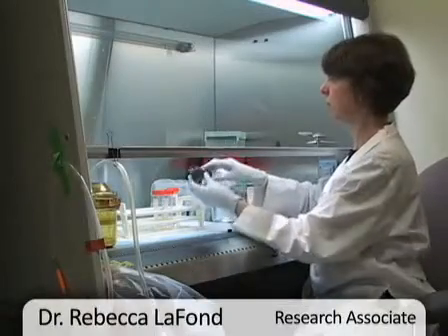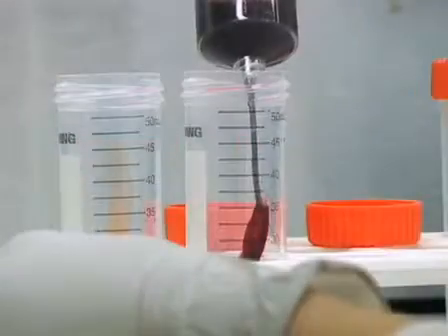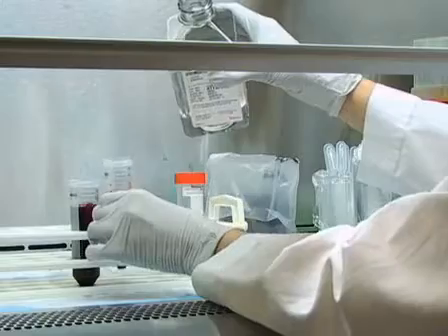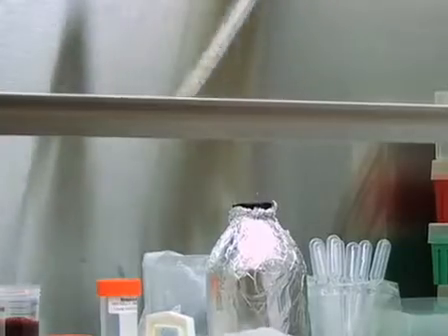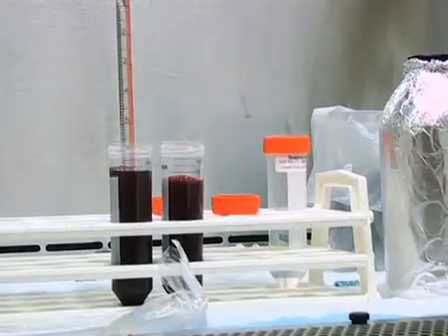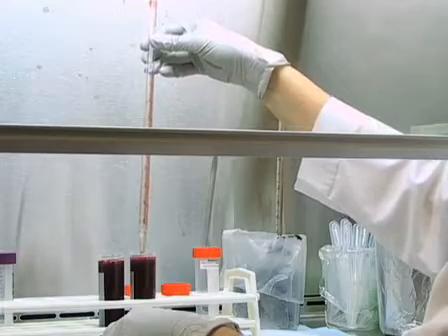Aliquot the blood into 50 milliliter conical tubes, 25 milliliters of blood per tube. Gently mix the blood before aliquoting to distribute the plasma. Add PBS, bringing the total volume to 40 milliliters, and underlay by drawing up 11 milliliters of Ficoll, inserting into blood tube, and carefully removing the pipette aid from the pipette. The Ficoll will slowly drain into the bottom of the tube. Once the level has equalized, slowly remove the pipette from the blood tube and discard.